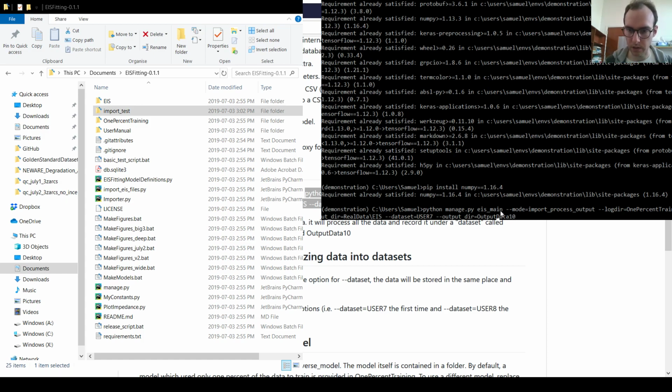So there are a bunch of options. The first things are not very important. Python is just the language we use. Manage.py, EISMain, it just means that there is this program that we're calling with this option, but this is the only option that we have to run the code.